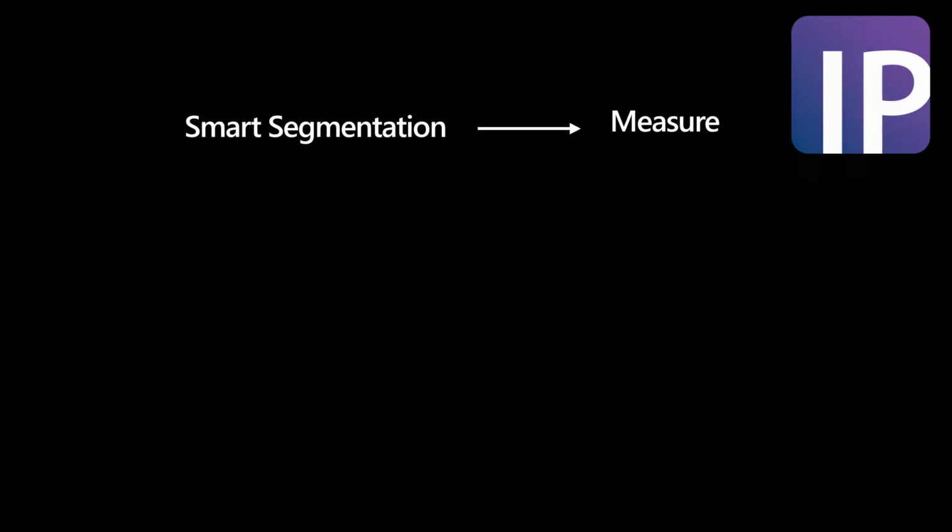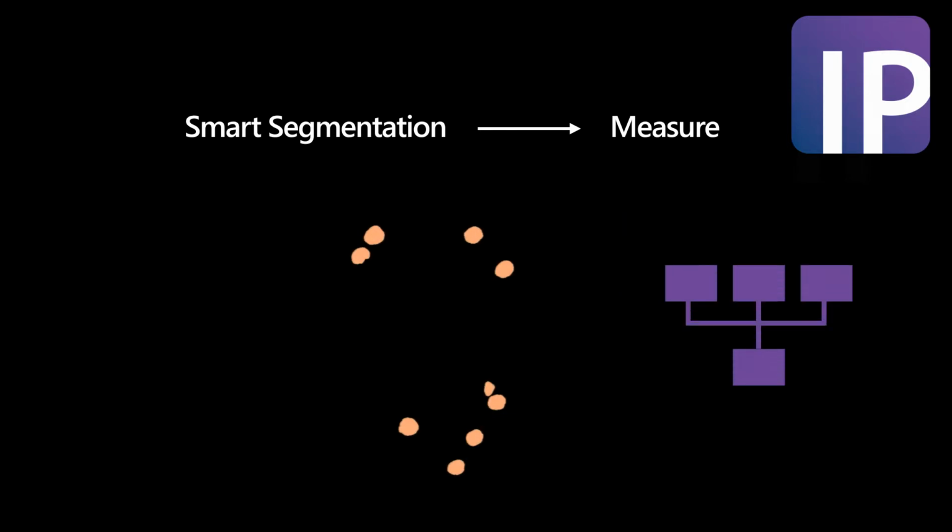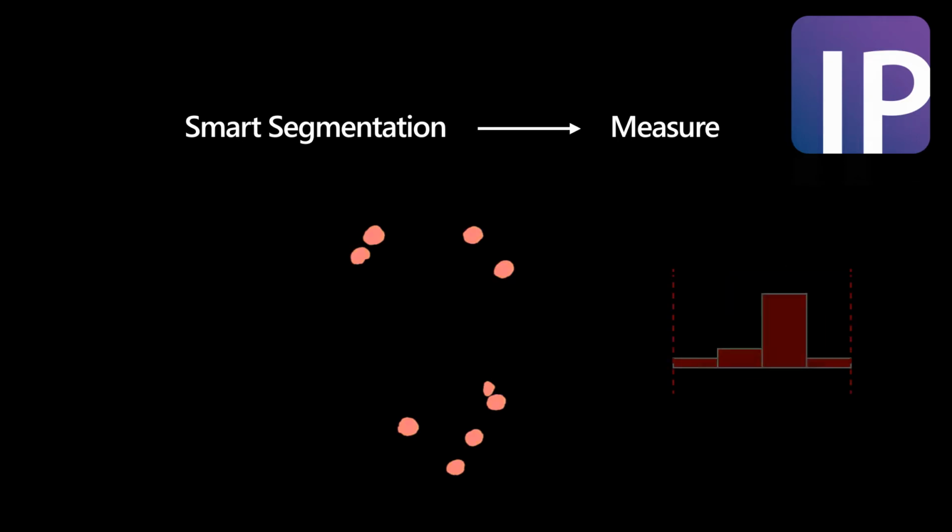Once isolating structures, the next stage of our process is to identify one or more measurements that will best fit your application data requirements. Measurements have been organized by the types and classified into categories. This vastly simplifies the measurement parameter selection and reduces the complexity that can occur with other packages. Image Pro provides an interactive object distribution histogram that allows the user to select a range or series of parameter ranges that can be set manually by the user or automatically by Image Pro.